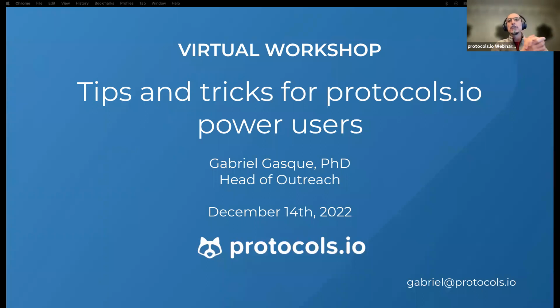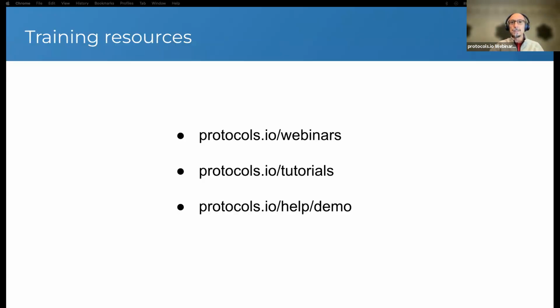So welcome to the Tips and Tricks webinar for power users of Protocols.io. Before we jump in, just a quick note. This is not an introductory webinar. This is a webinar intended for advanced users.